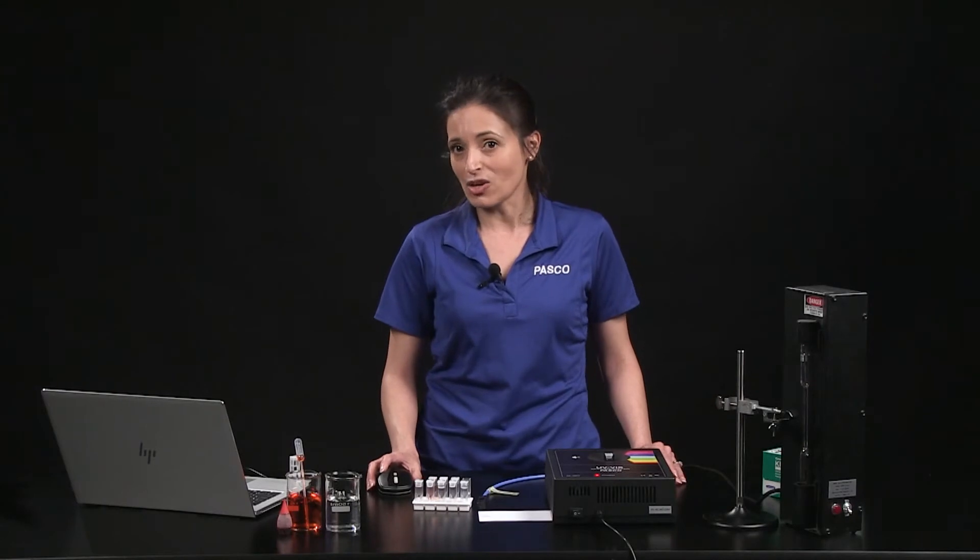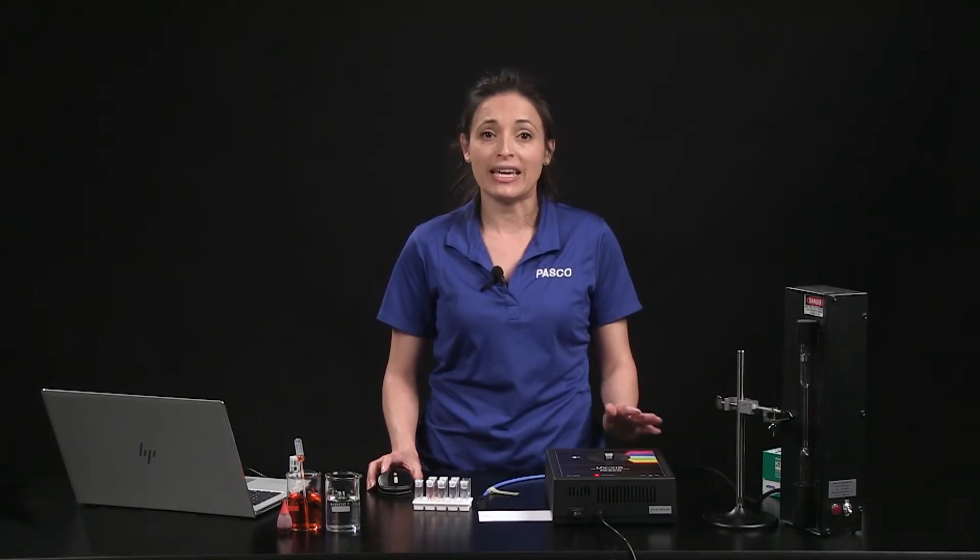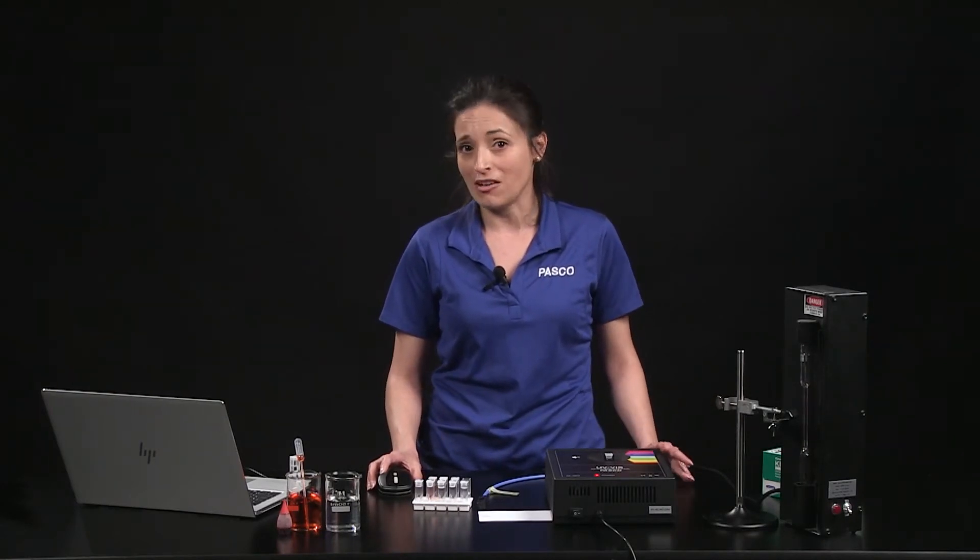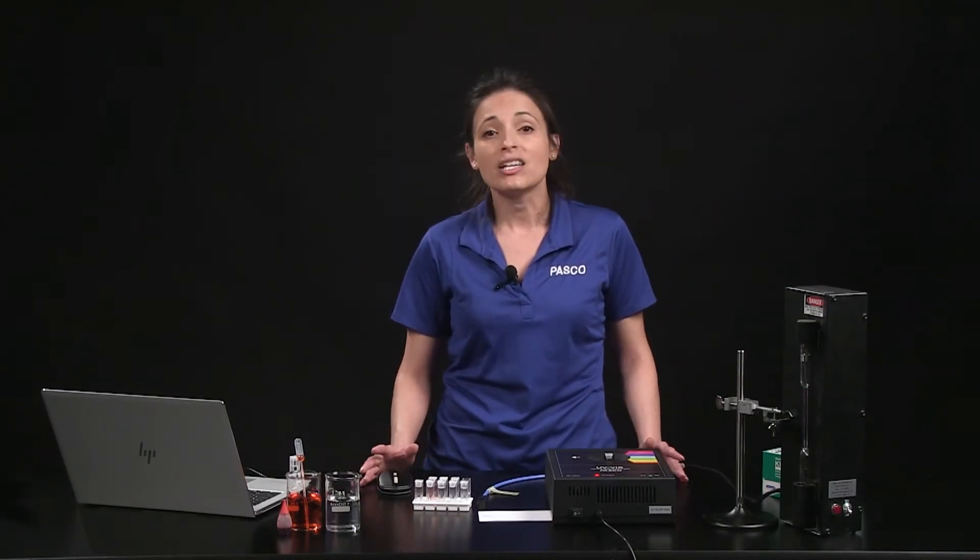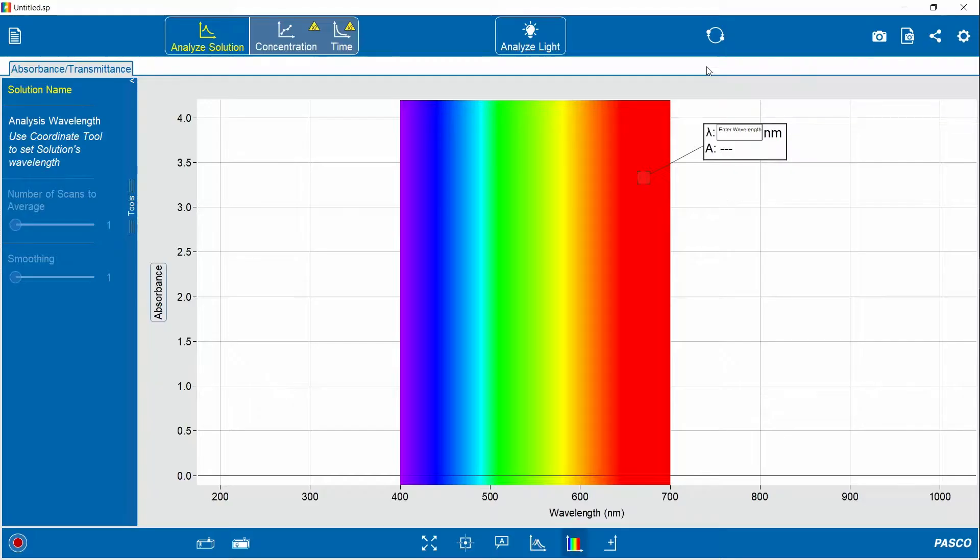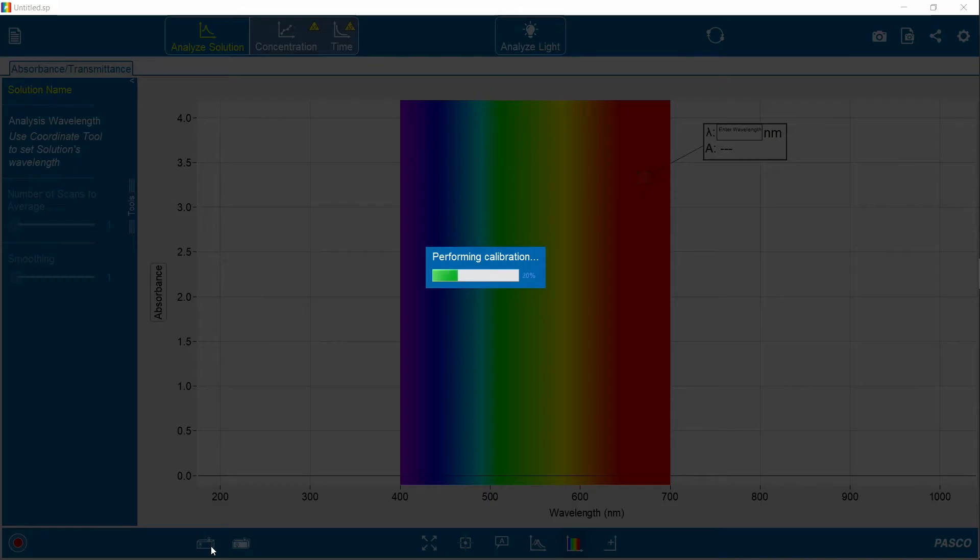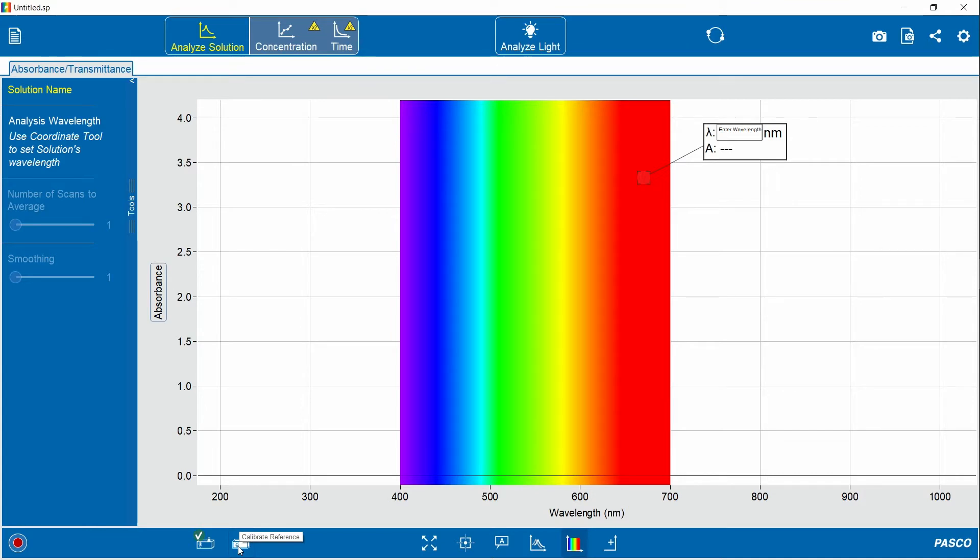To investigate solutions, start by calibrating the spectrometer with your blank or the substance that you use as a solvent. I used distilled water for the solutions I'm using today, so that's what's in this cuvette. In the software, click calibrate dark, and then calibrate light.